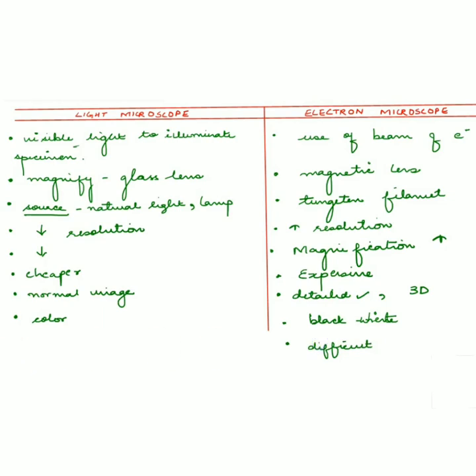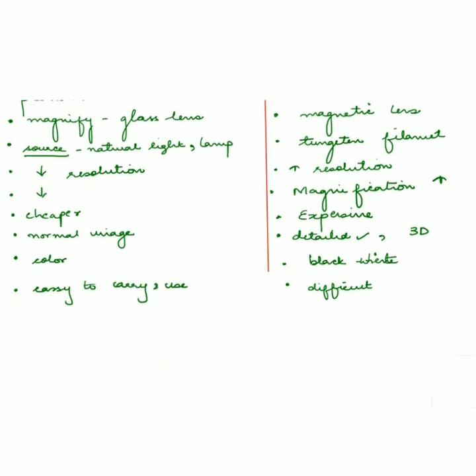It is very difficult to carry an electron microscope, but in case of light microscope, it is very handy, so we can use it easily.